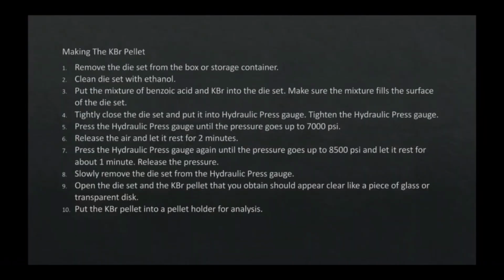To make the KBr pellet, remove the die set from the box or storage container. Clean the die set with ethanol. Put the mixture of benzoic acid and KBr into the die set. Make sure the mixture fills the surface of the die set. Tightly close the die set and put it into the hydraulic press. Tighten the hydraulic press.